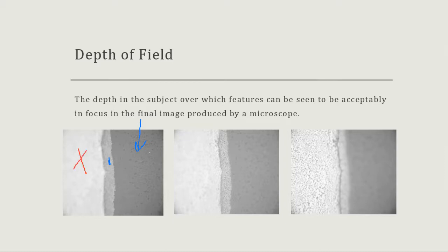The middle image, this one's not in focus, but the one in blue is in focus. And for that last image, that's not in focus, this is not in focus, and you're left with this material.